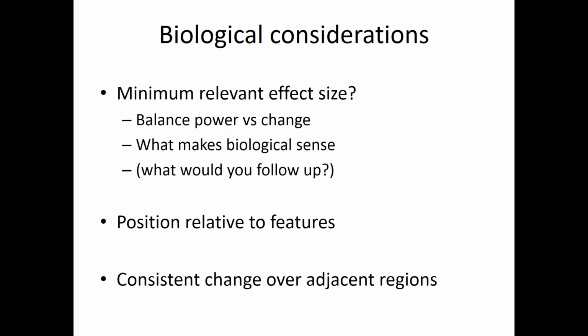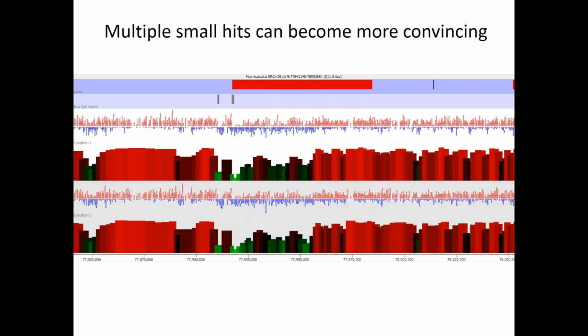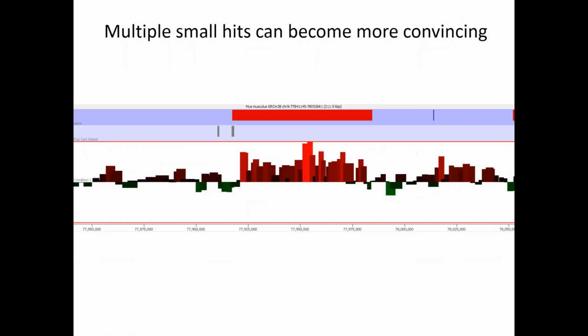So just to illustrate that with a couple of examples, this was a region that we analysed last year. And when you look at it overall, they look pretty similar. So the methylation levels between these two samples, the profile and the level of methylation actually looks quite similar, but the statistics were actually picking out several points within here as being different, which were not very exciting large differences. But if I view my data again, not by looking at the absolute levels, but by plotting the difference between the two samples, I get this.